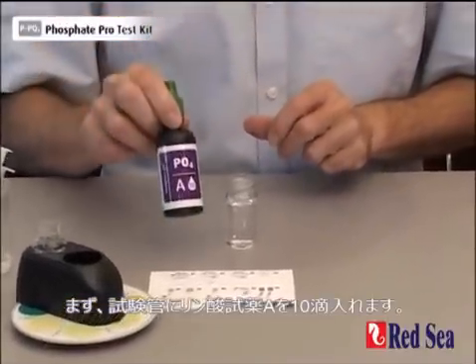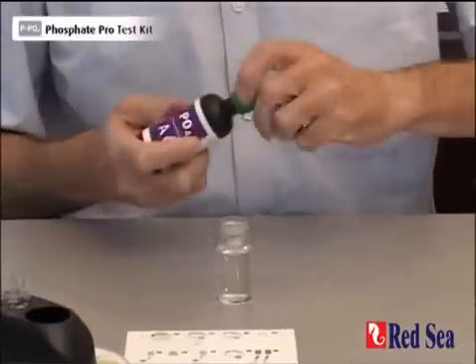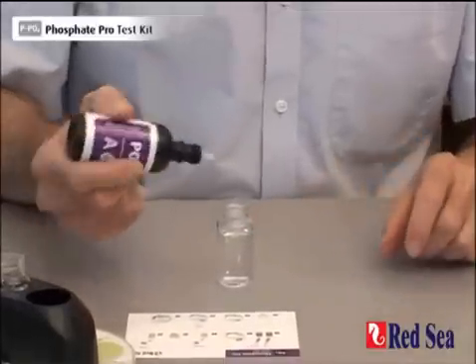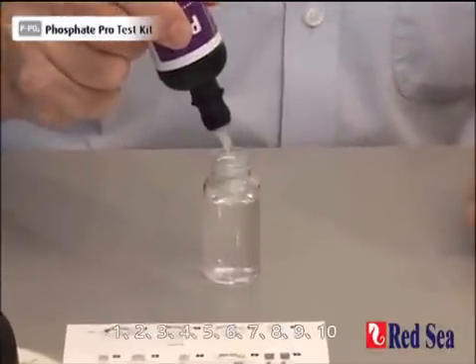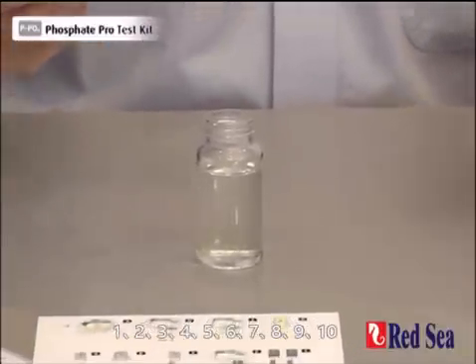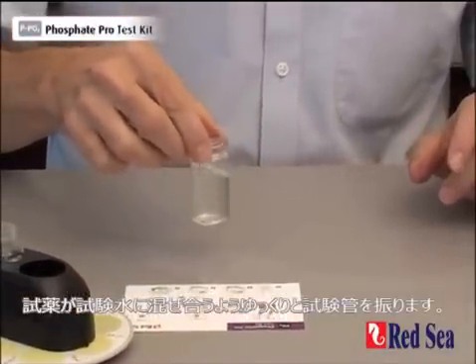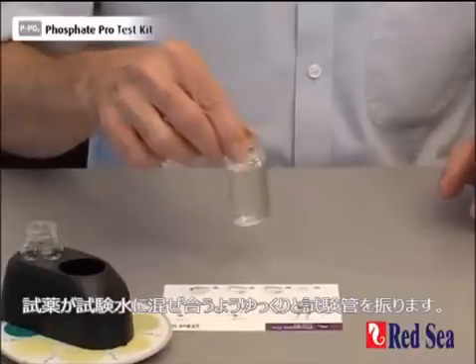First, we have to add 10 drops of phosphate reagent A. 1, 2, 3, 4, 5, 6, 7, 8, 9, 10. Gently shake the vial to ensure that the reagent mixes with the water sample.